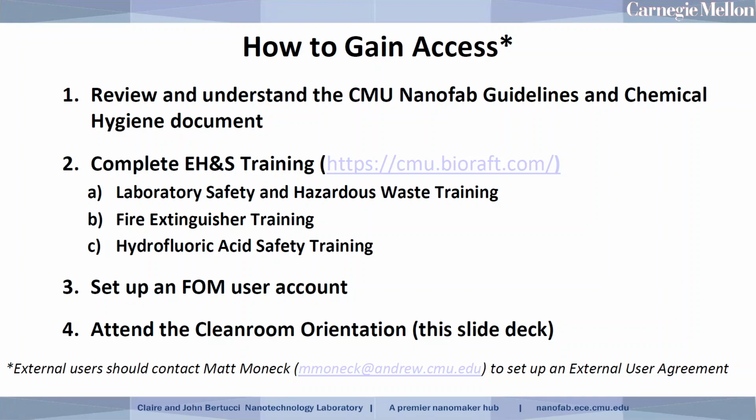The second thing that you can start on, if you haven't already, is completing the relevant EH&S training, which is handled through CMU's BioRaft software. So there are three main trainings that you'll need to complete. First, the lab safety and hazardous waste training. Second, the fire extinguisher training. And thirdly, the hydrofluoric acid safety training, which is required for all users regardless of whether you'll be using HF in the lab.